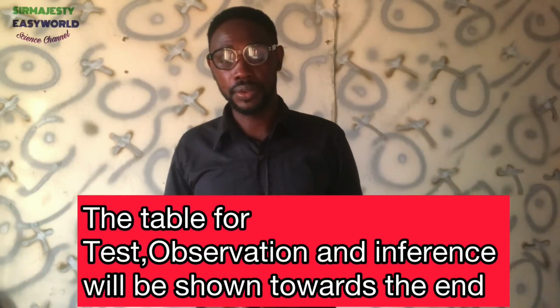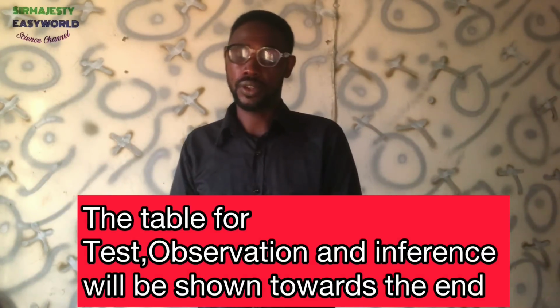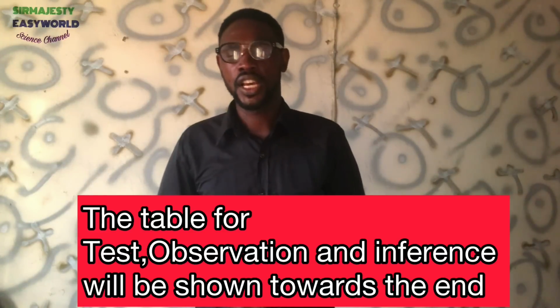I'll be analyzing zinc chloride and milk powder theoretically, using the list of specimens provided. You will see a comprehensive table with test, observation and inference on the analysis of these two samples. Looking at the reagents made available for us, if you take a look at zinc chloride, we think straightforward that we must test for zinc ion, and secondly, we might probably test for chloride ion.